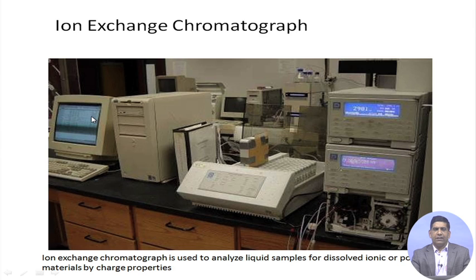As I said earlier, the computer software is there these days to help you with the calibration curve and with the detection of the different analytes present. So what is it used for? It is used to analyze liquid samples for dissolved ionic or polar materials by charged property. So that's what it is used for.